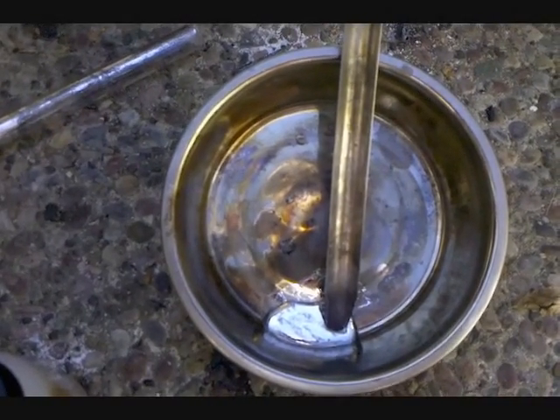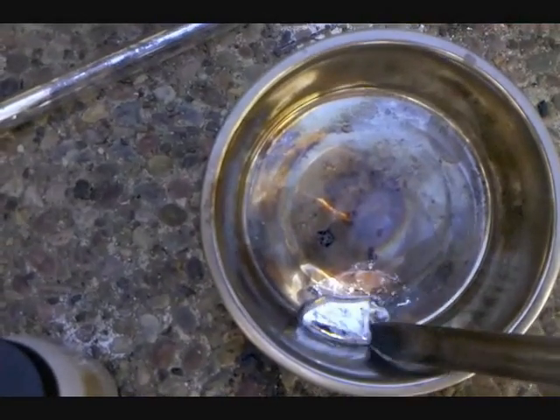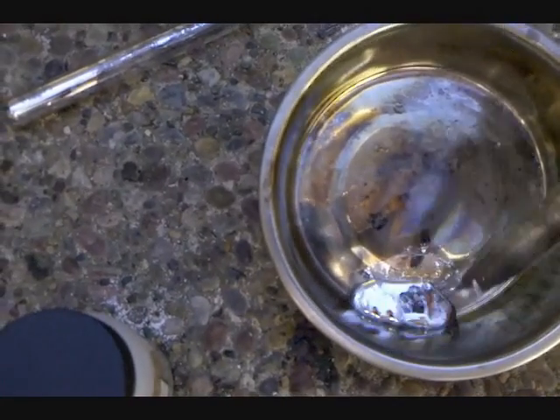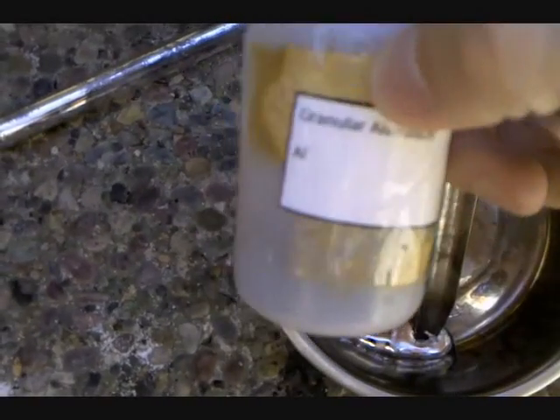Hello, everyone. In this video, I'm going to be making an alloy of gallium and aluminum. Gallium is a metal right here — it's a liquid slightly above room temperature. Aluminum, I think we all know of. I have granular aluminum right here.